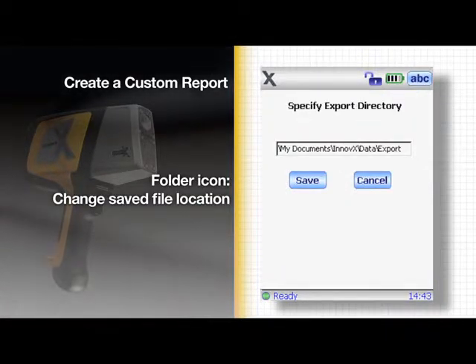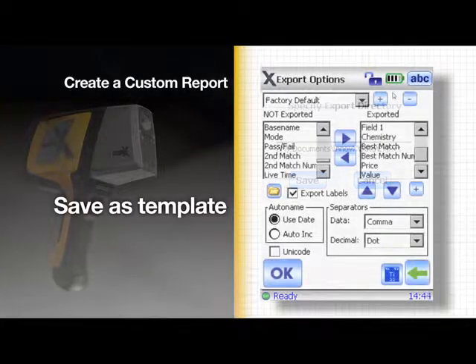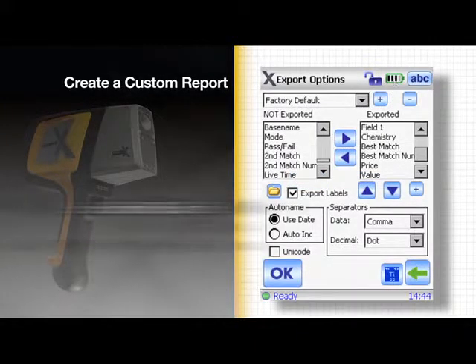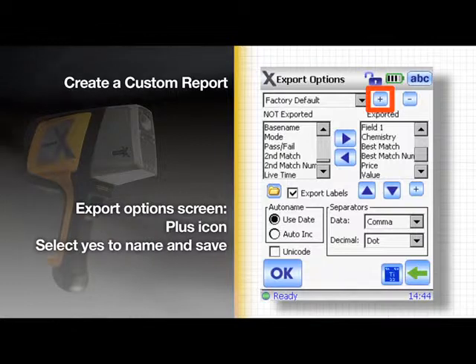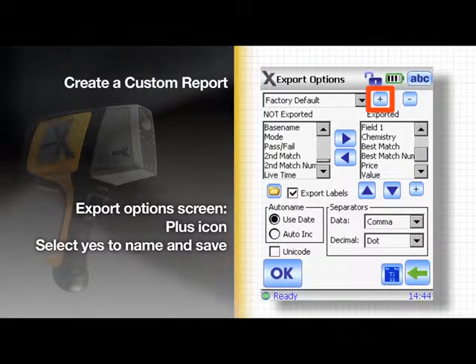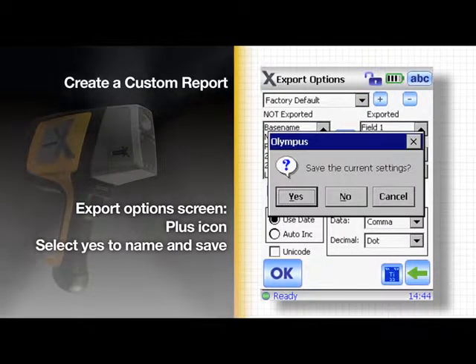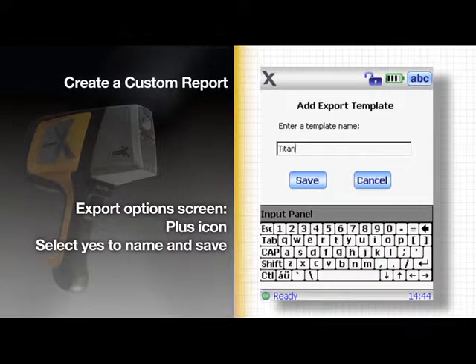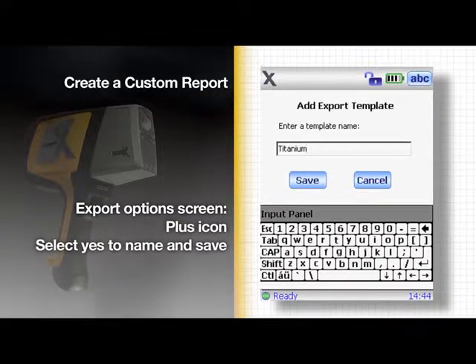Now that we have changed some settings, we can save this as a template. Tap the plus icon at the top of the export options page, then select yes to save and name your template. Now it's time to export the data.